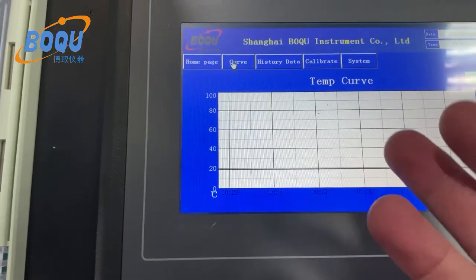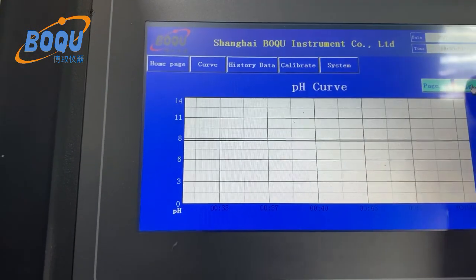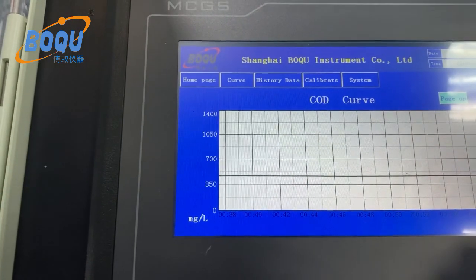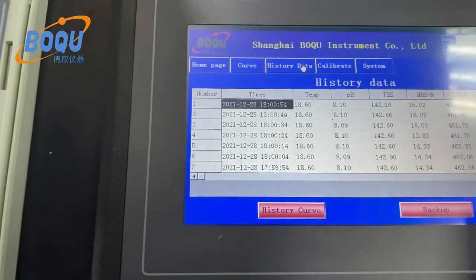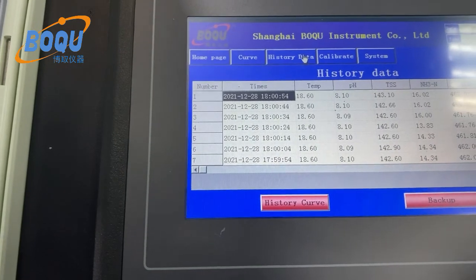Here is the real-time COD — continuous measurement for COD. You can see the COD difference, and TSS and COD curves. Here is history data: history data recording all measured data, and the recording period is around 10 seconds.